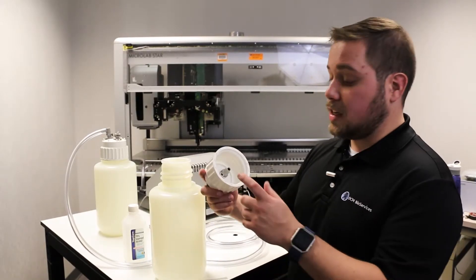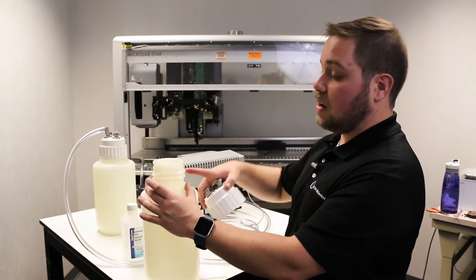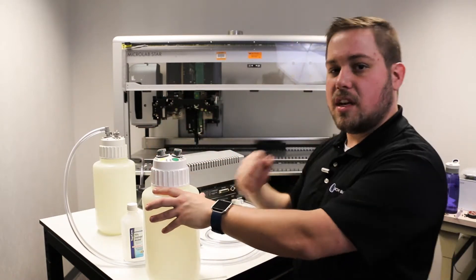Before reassembling the cap, you'll want to check to make sure that your o-ring is nice and clean in the cap, and that the threading on the bottle itself is clear. Hand tighten and give it a little extra resistance just to get a good seal.